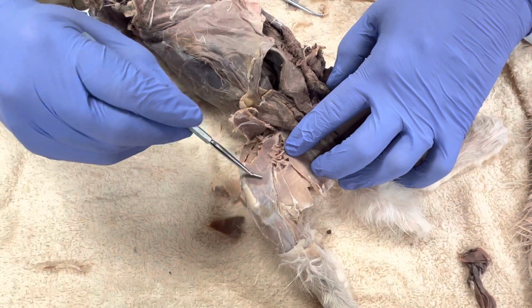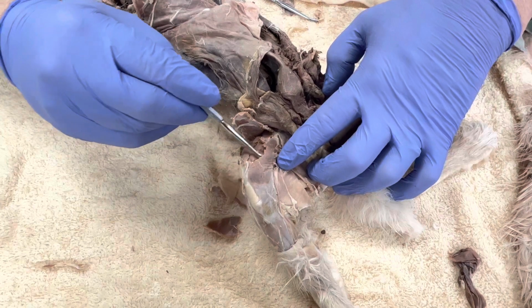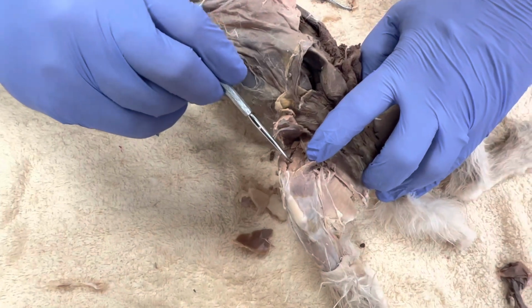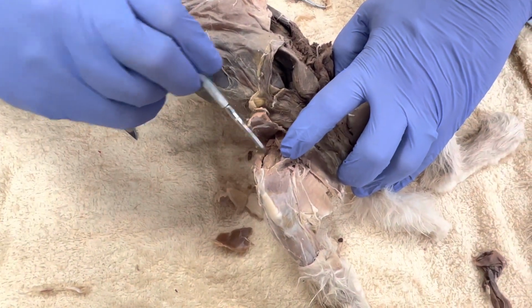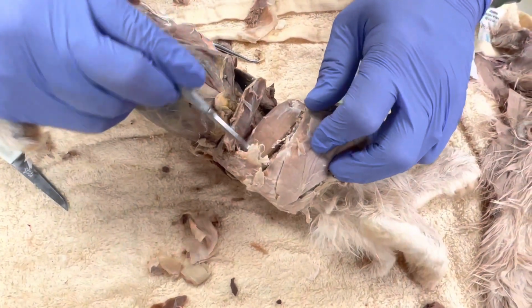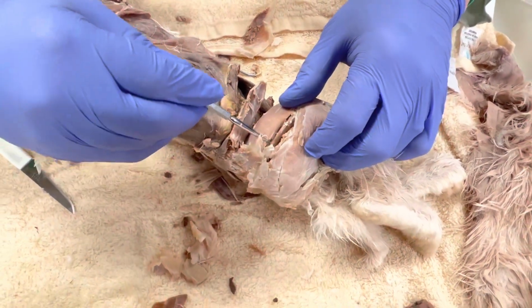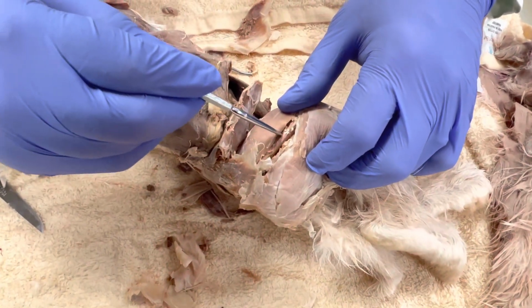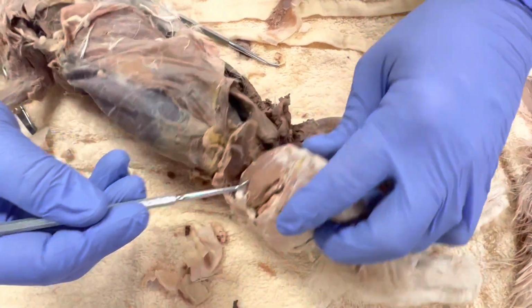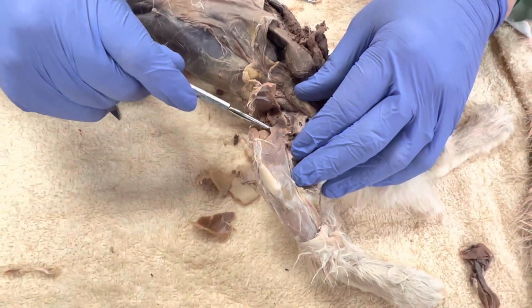This is going to be my Vastus Medialis. So this muscle right here is the Vastus Medialis. And then I have right here my rectus femoris. That's my rectus femoris right there. Then I have my Vastus lateralis. That's my Vastus lateralis. And then if I go down in here, and I look right here, this is my Vastus intermedius. So this is the Vastus intermedius with the Vastus lateralis, with the rectus femoris, and the Vastus medialis make up my quadricep muscles.